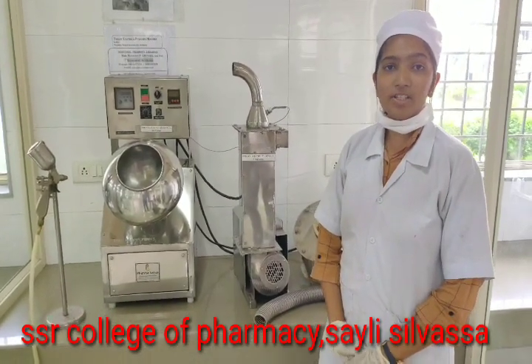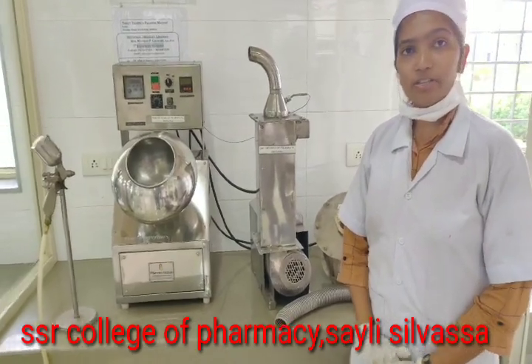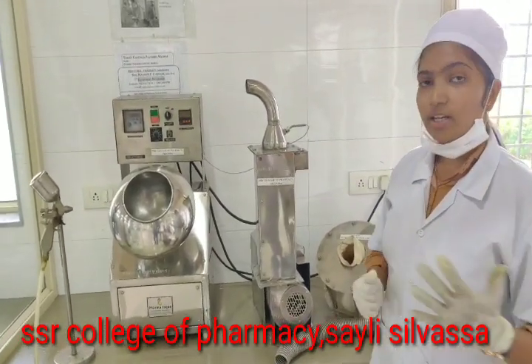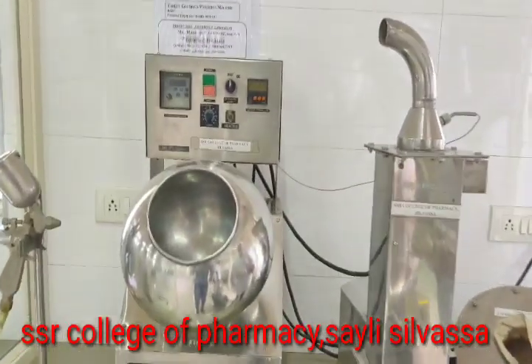Hello friends, I am Kinjal Patel pursuing my M.Com from the Department of Pharmaceuticals from SSR College of Pharmacy. Today I will be talking about tablet coating and polishing machine.